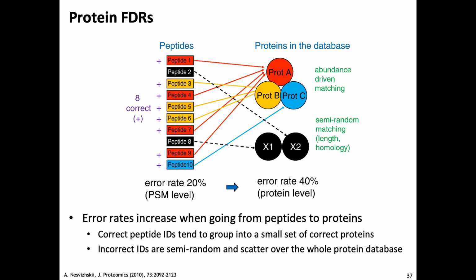OK. I'll stop here, and we continue with the hands-on, and you can try out this FDR, and try out what changing the search does to your results.